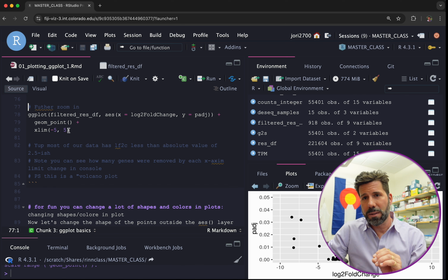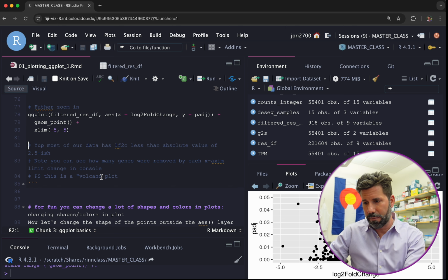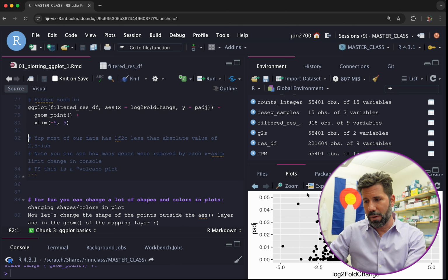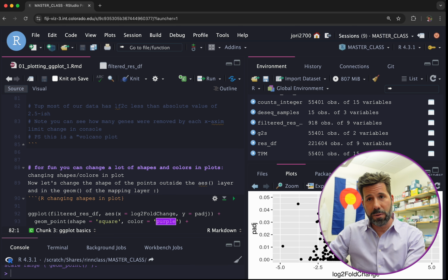You'll notice in hist, when we did the hist function, you had to have the c and then the parentheses with the two axes separated by a comma. In this case, you don't need the c. Okay, so just zooming in slightly further here, and we can see a bulk of our data is in this range. And we have no data in here because that is what we filtered on.